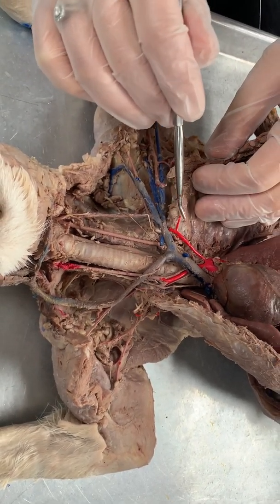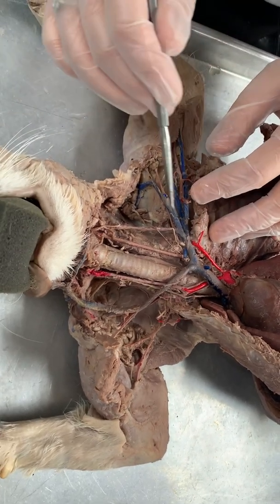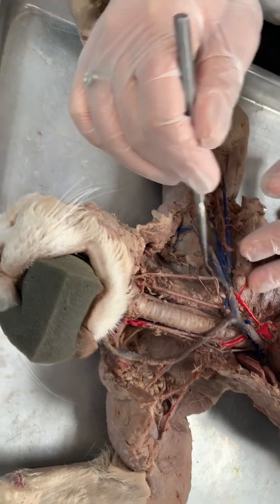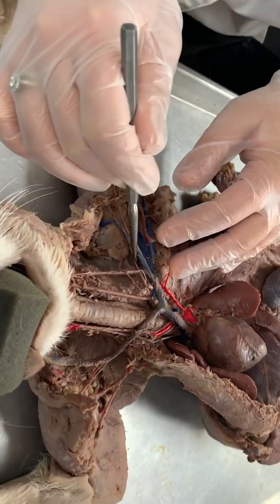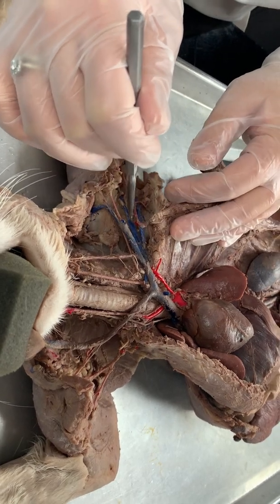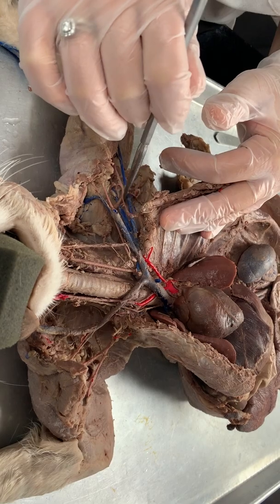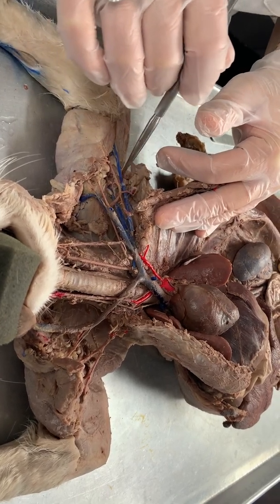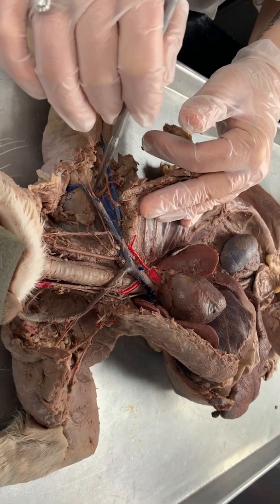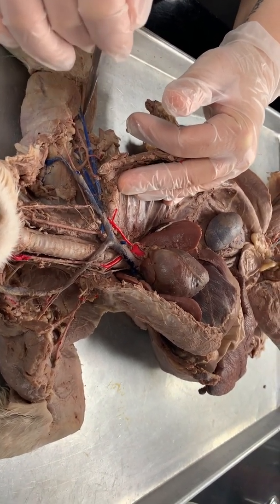This is your internal mammary, okay? And then, where did we pick up this? Right over here. Okay, so after the thyrocervical, this would become the axillary artery. And then there's not a great subscapular on here. It's right there. Then it would become the brachial, but I wouldn't peg that on this cat.